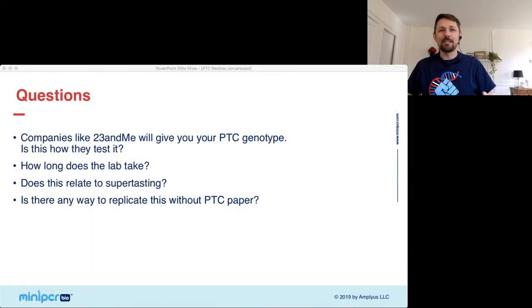We're back. Okay, so just to wrap things up, folks submitted some questions. Great one. Companies like 23andMe give you your PTC genotype. Is this how they test it? No, they don't use gel electrophoresis.